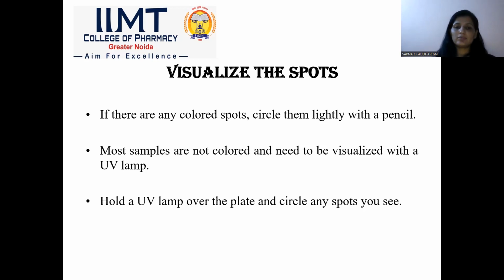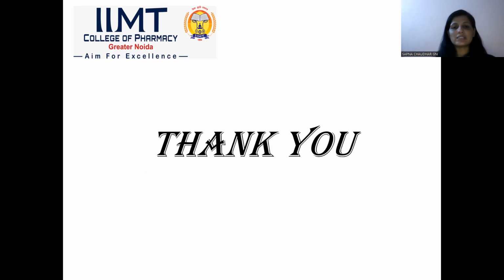So you can separate and analyze the mixture using the TLC technique. So that's all about the introduction of the TLC technique.